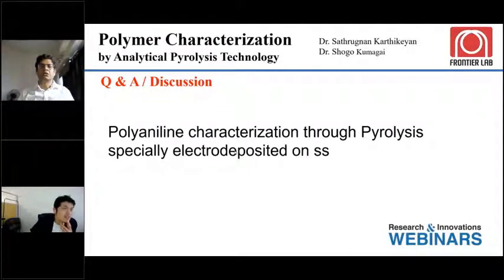What is SS? Because they have electrode deposited on a stainless steel, and they wanted to analyze this. Okay, so that means the stainless steel sample, they want to put it into our system. That should be possible in principle. Have you done any kind of polyaniline type of samples?